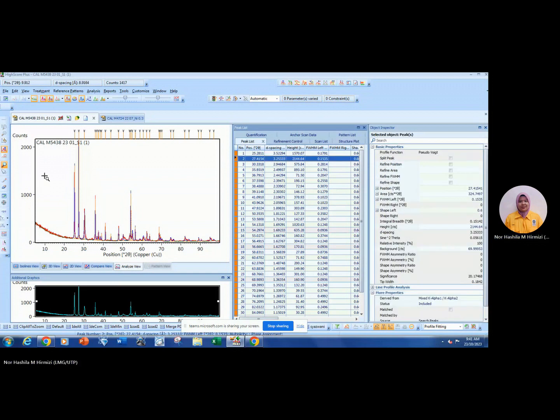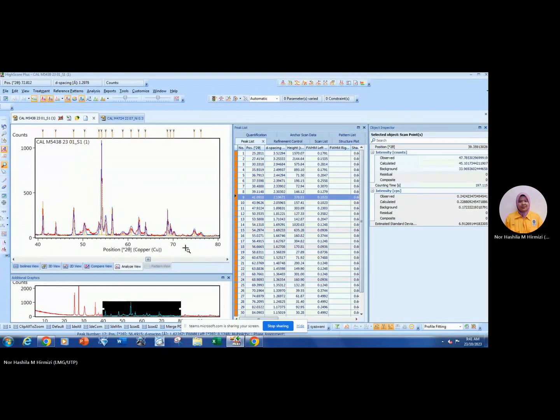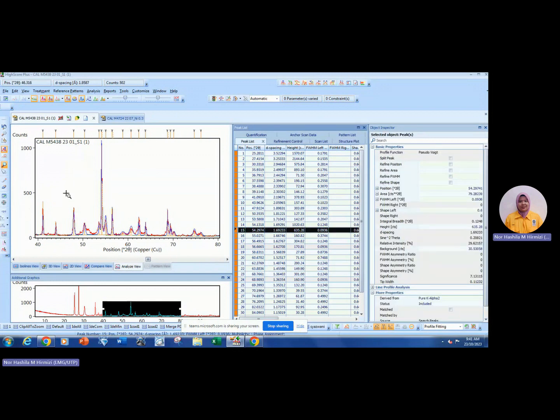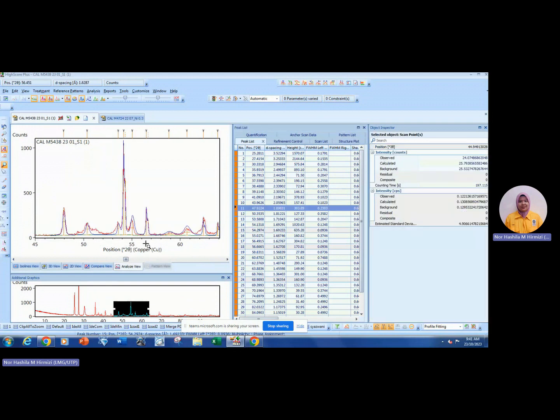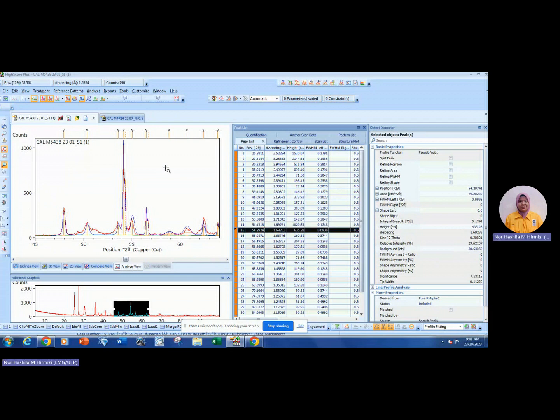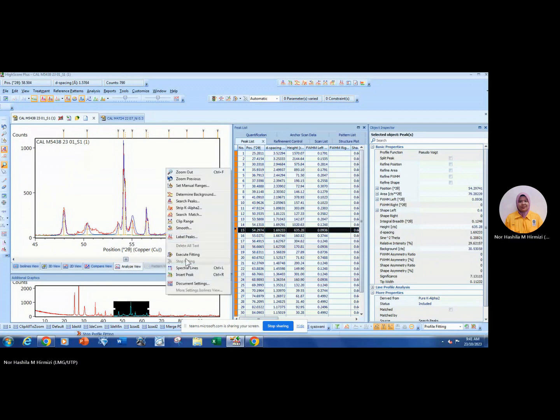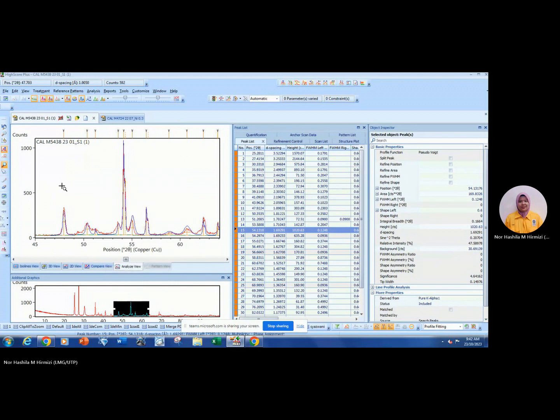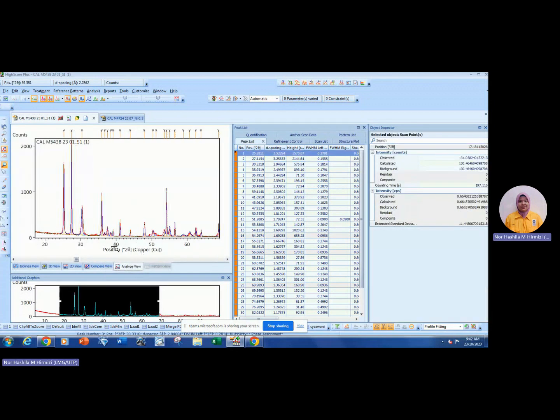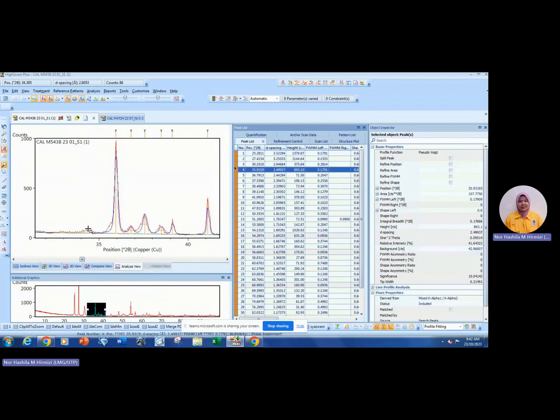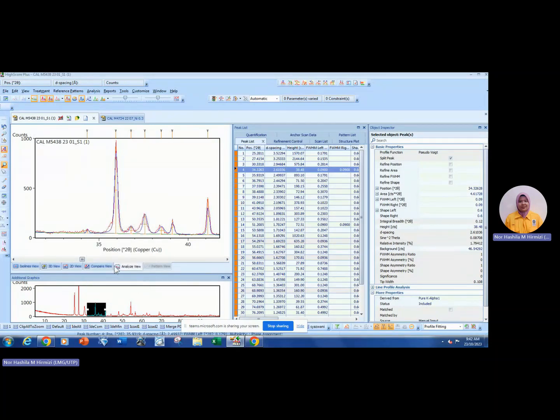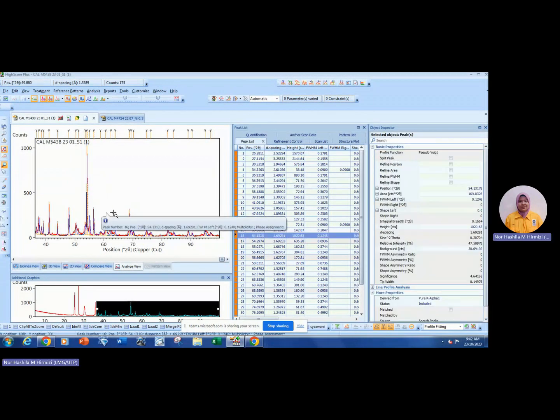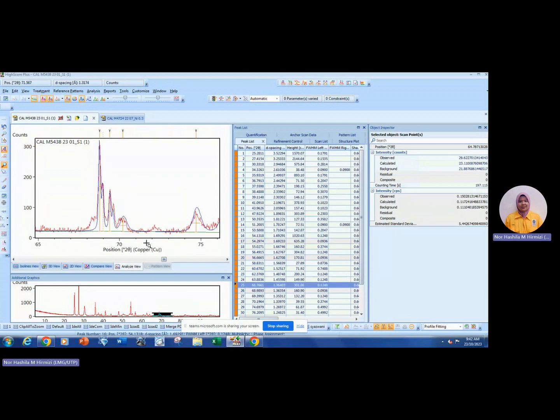If you see that some peaks are not being identified by the software, you can always add them in. Right-click and choose 'Insert Peak,' point to the location, then right-click 'Insert Peak' again to deactivate. Repeat this for any other missing peaks.